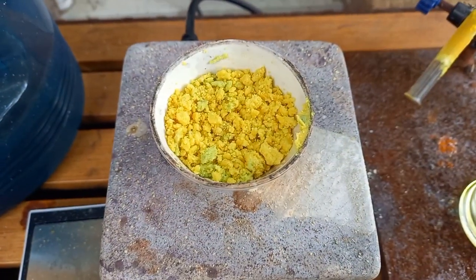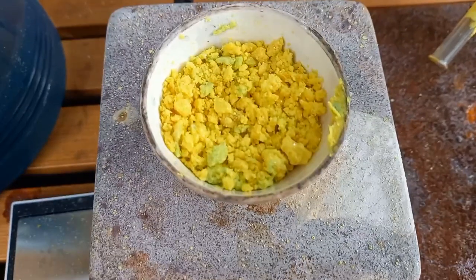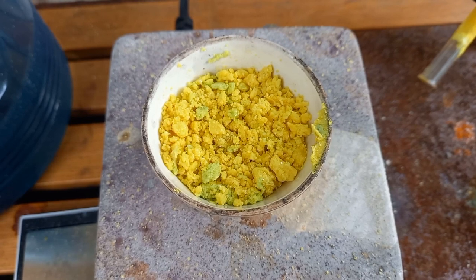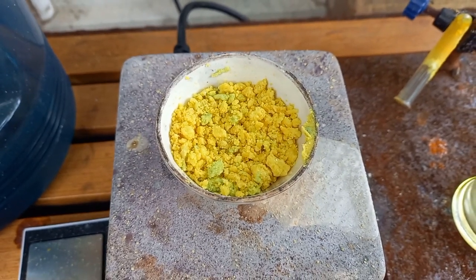Here we have potassium ferrocyanide with some slight green contamination, but it doesn't matter I don't think. We need to make this anhydrous for the next step.